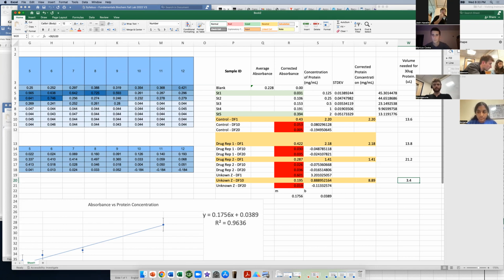So the problem in the Tuesday lab was I didn't use the NPB lysis buffer to make the standards. So basically there was unaccounted for background noise in between our samples and our standards. Does that part make sense? So you used the NPB lysis buffer for the blanks and our unknown proteins.